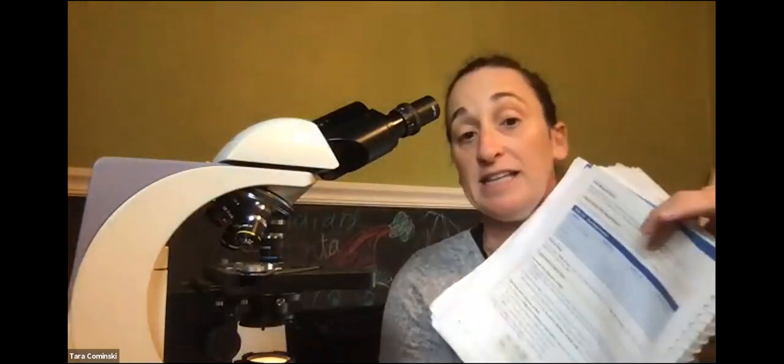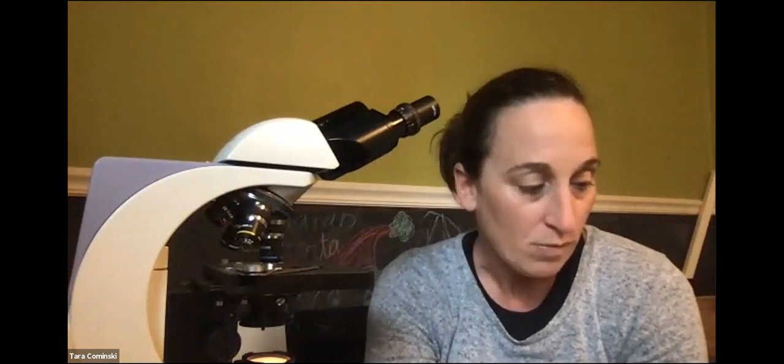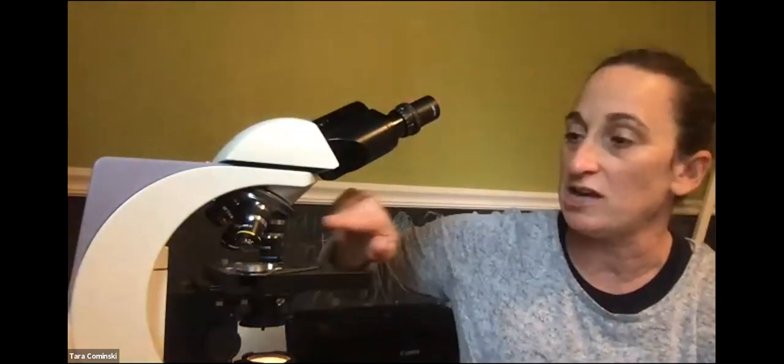So you should be completing this table, okay? We did that just for the high power. I started with that just because it was already in here. Under high power, the ocular lens is 10. The ocular lens is always 10, because this doesn't change. What changes is the objectives as you switch them. For that high power, the objective lens is 40x. Total magnification is 40 times 10, which is 400. You should be able to complete the rest of that table on your own.